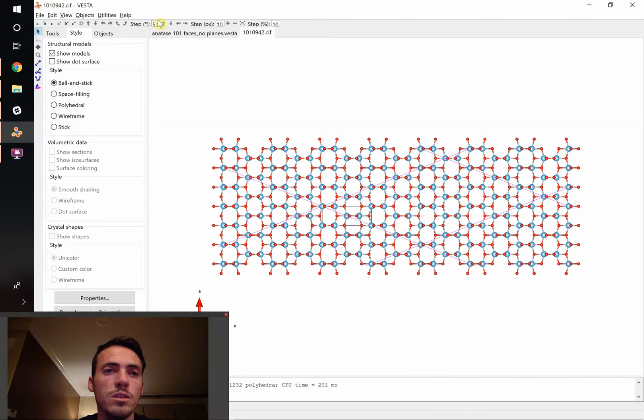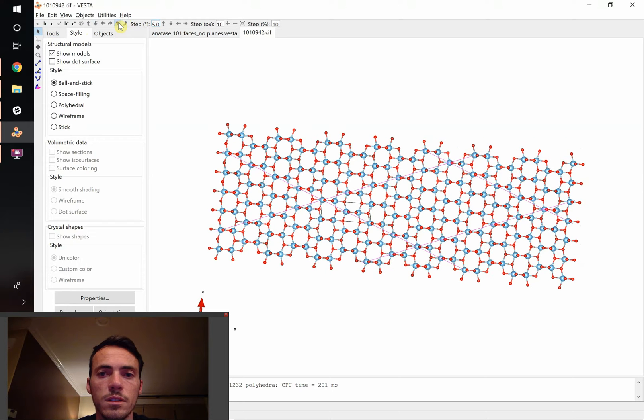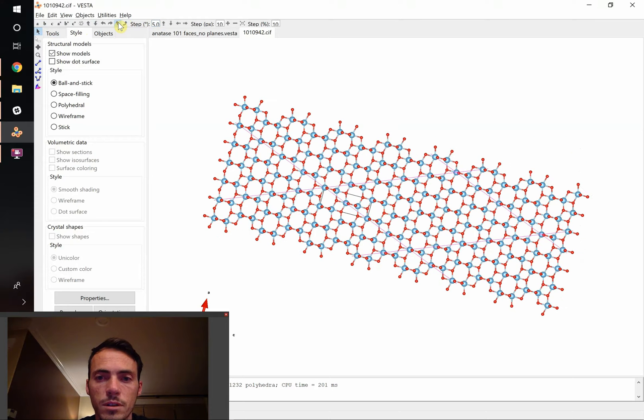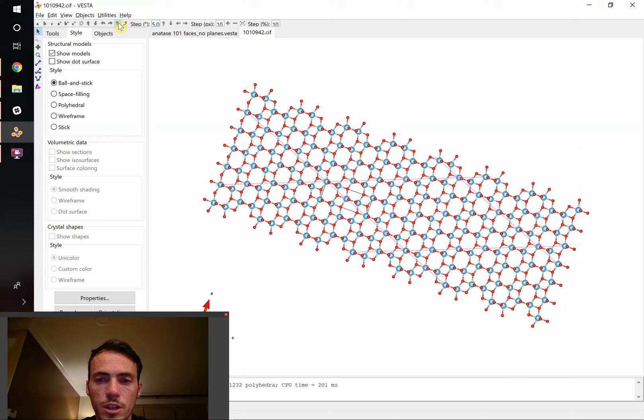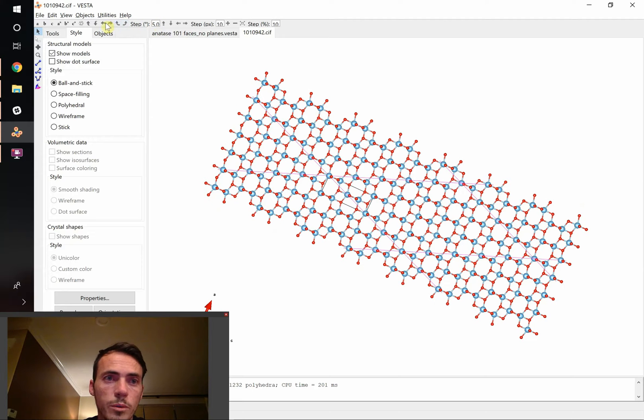And instead you can just tell it to move five degrees at a time. We can rotate about the Z axis. So we can keep on rotating that. We could change it to be more or less than five. It looks like we overdid it.